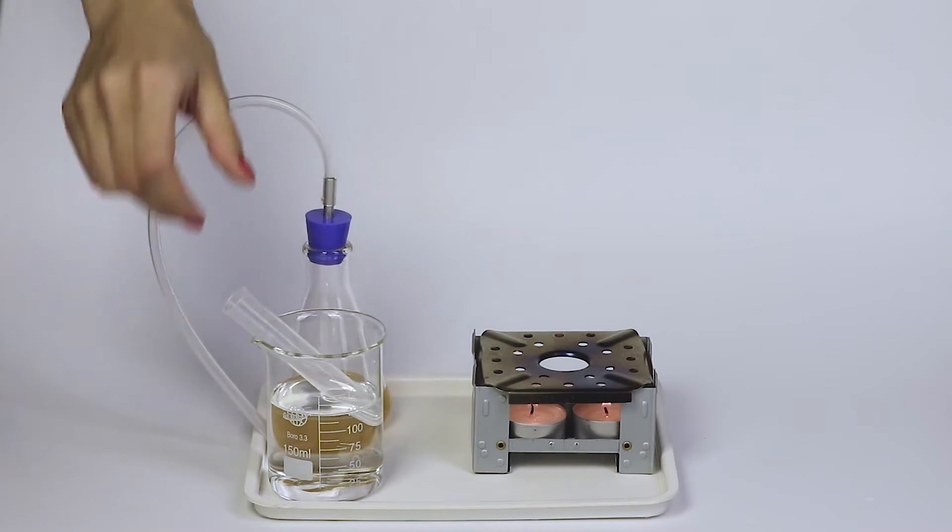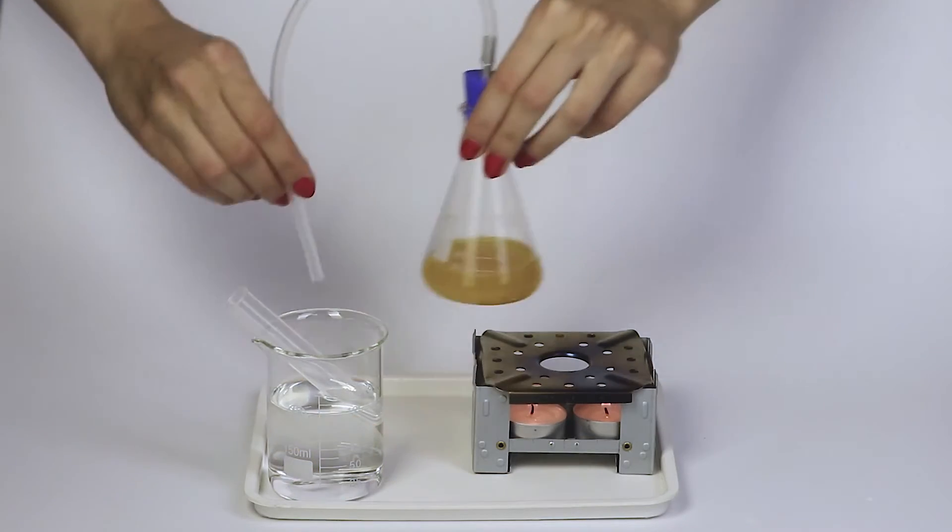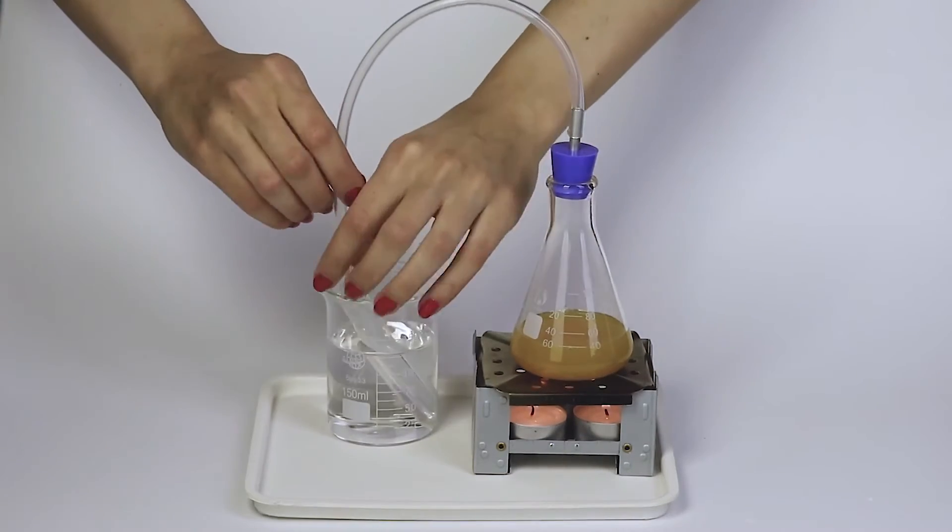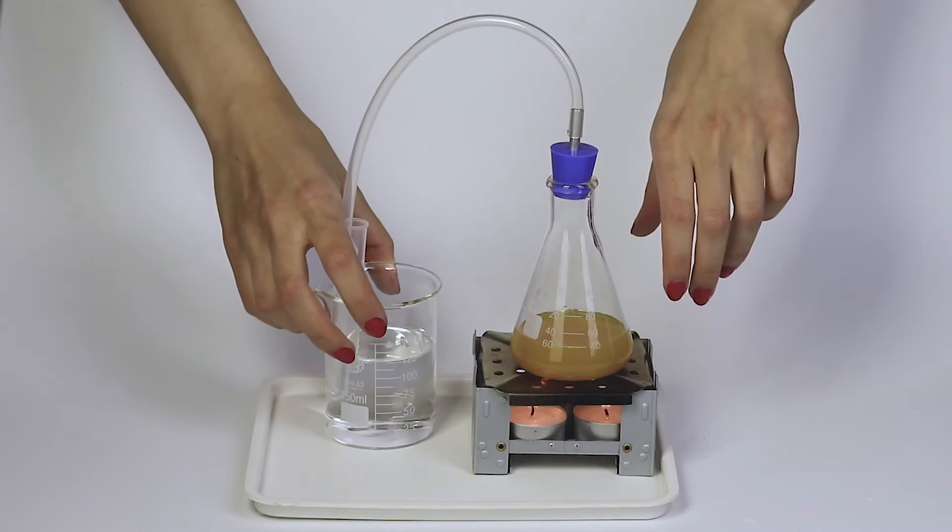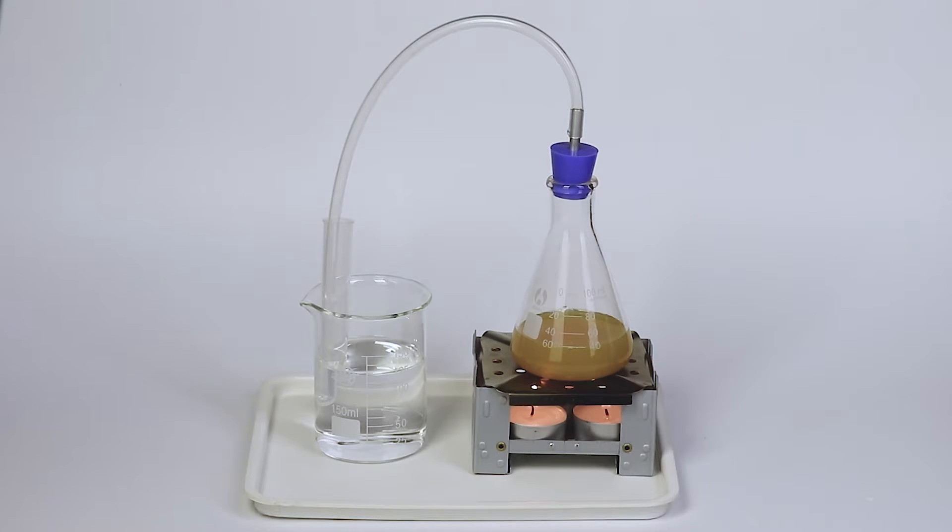Now put the test tube into the beaker with the water. Put the flask onto the flame diffuser and place the loose end of the silicon tube into the test tube.